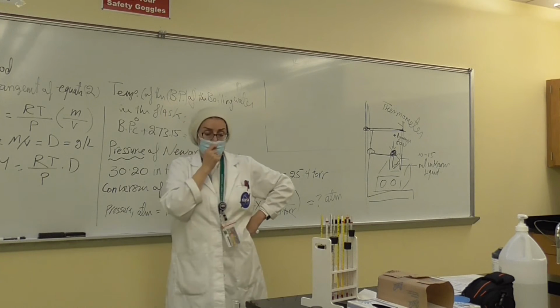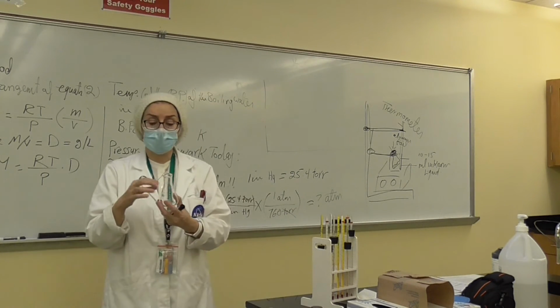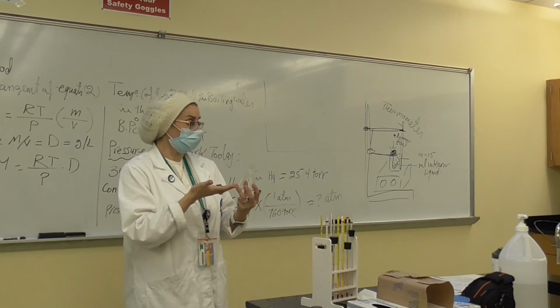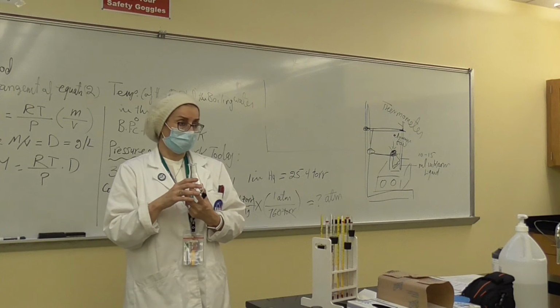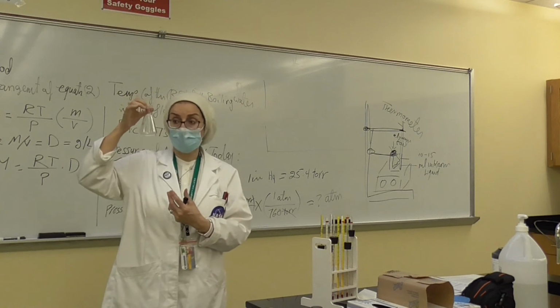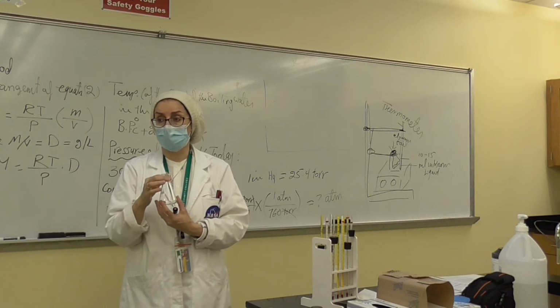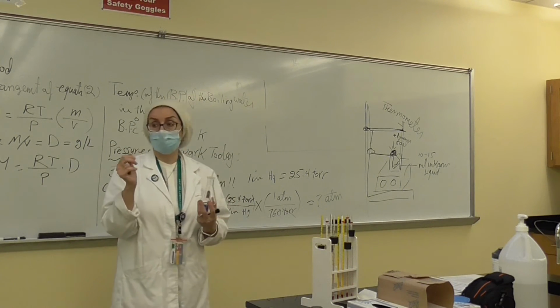How about the volume? Now we know when we are going to heat the liquid, what is the volume of the gas? It's going to be, after you heat it, equal to the container. To that container. That's absolutely right, Sarah. So what do we have to do after you're done? Because we need to have 3 trials.